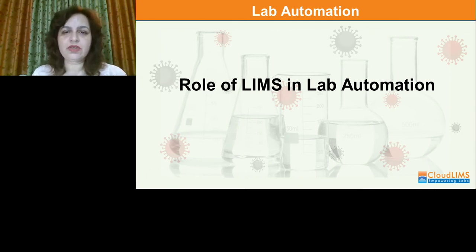The facility was testing 1,000 samples a day, and with a robust robotics pipeline and informatics support, the daily testing could be ramped up to 3,000 samples a day. So this is the power of automation and informatics that we're about to discuss in the coming slides.